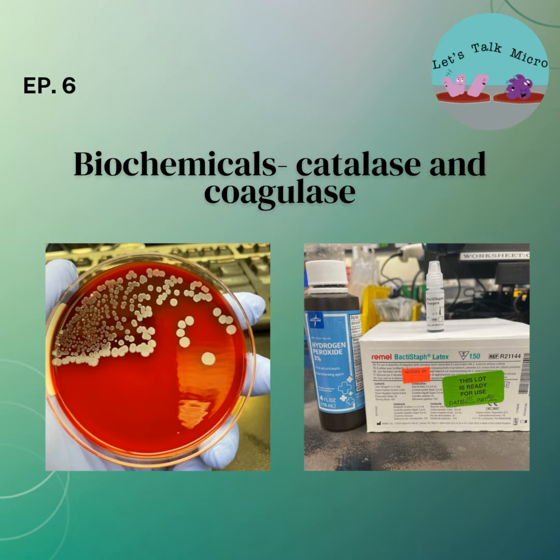The reactions can be so strong, especially with Staph aureus, that you can actually observe agglutination while you're mixing. And if not, once you mix your colonies, you tilt your card and observe for that agglutination. You should see clumping with a clear background.